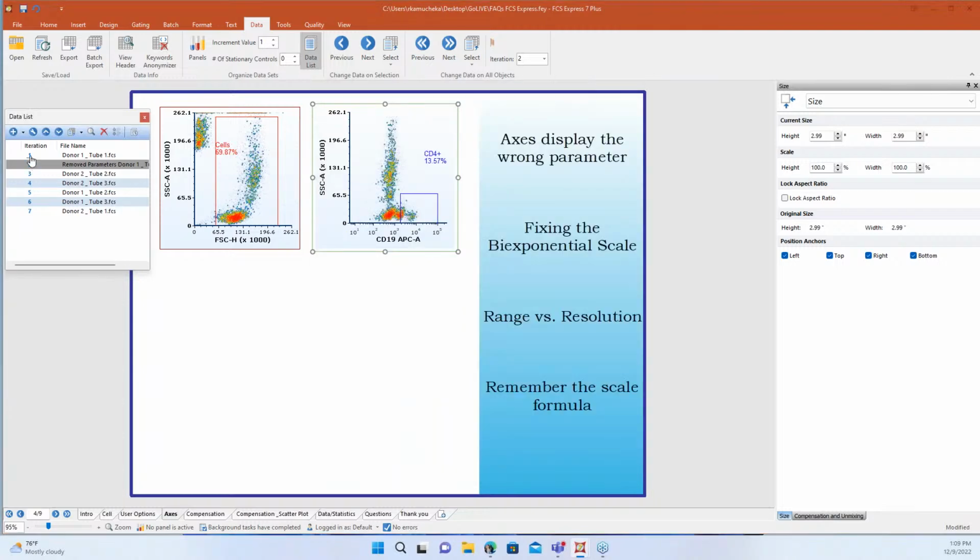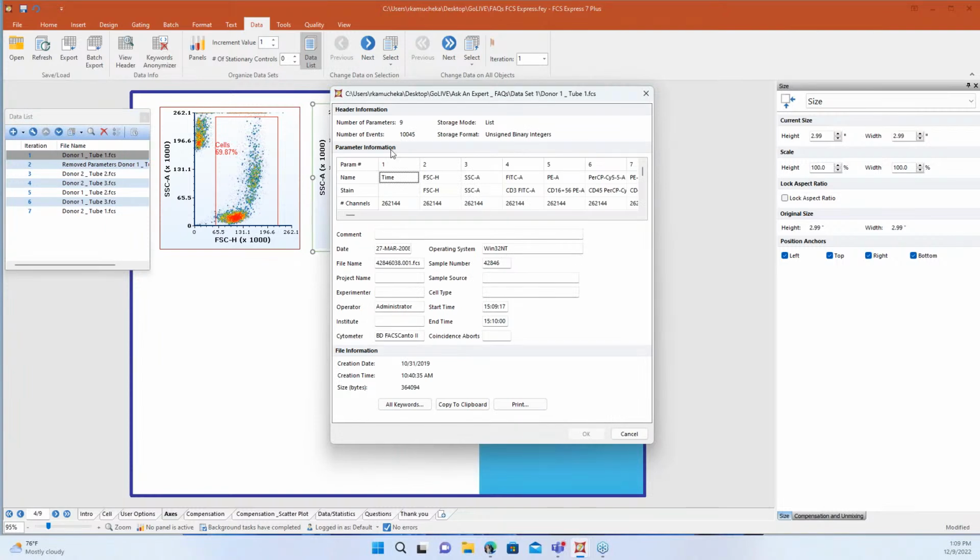If I move back to that other data file and do view header, I'm going to see this one has 9 parameters. Sometimes when you take out a parameter or add new ones, it's not really sensical. It doesn't just go at the end so that it would be a nice transition. The instrument decides how that goes. Sometimes when you add a new parameter, it's going to go in number 6 or number 3, so everything downstream gets shifted. It's really up to the instrument how it handles parameters. This is a big thing that we see a lot.